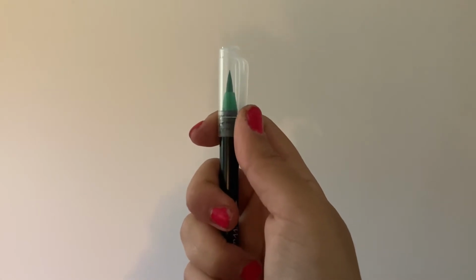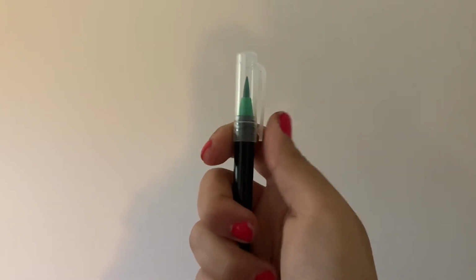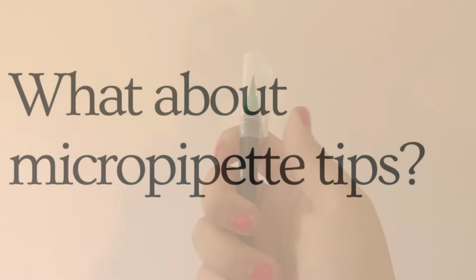You set the range of your pipette by twisting the top. And always remember, once you're done, to make sure to set the range back in the middle.